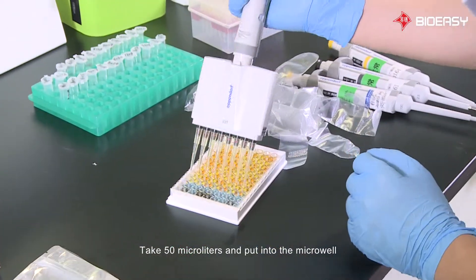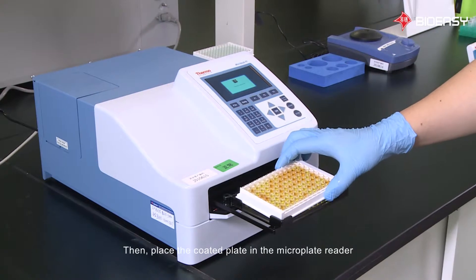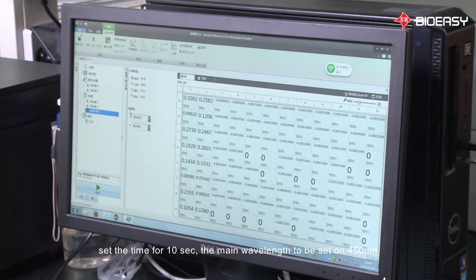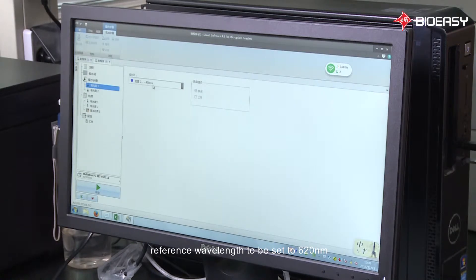Take 50 microliters and put it into the microwell, then place the coated plate into the microplate reader. Open the reader software and set the time for 10 seconds, the main wavelength to 450 nm, and the reference wavelength to 620 nm.